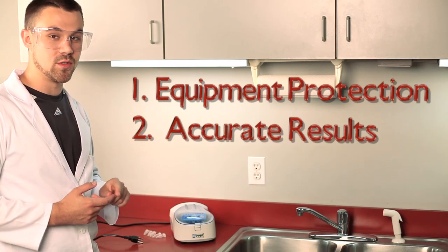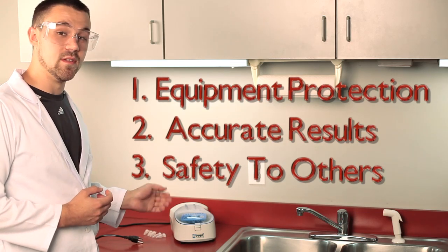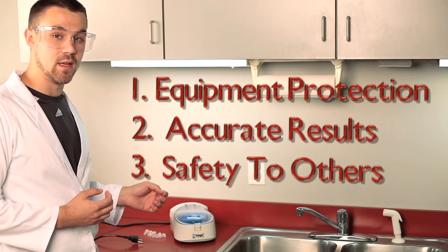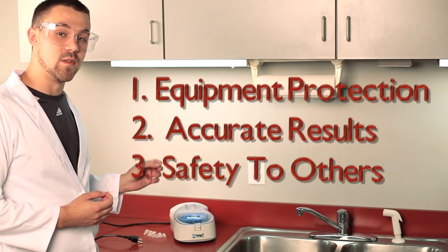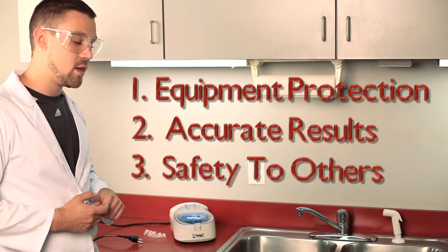And lastly, and most importantly, safety to others. These motors, even these minis, are spinning very fast, some up to 6,000 RPMs. That's 100 rounds a second. If the rotor breaks, if the motor breaks and a piece comes off and someone's nearby, it's going to hurt.